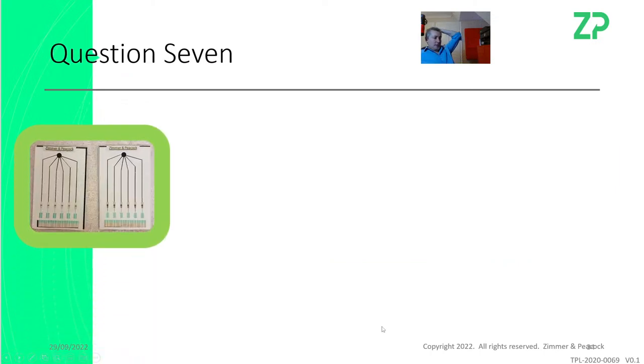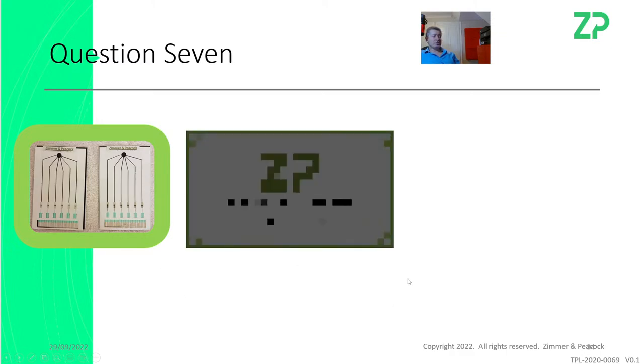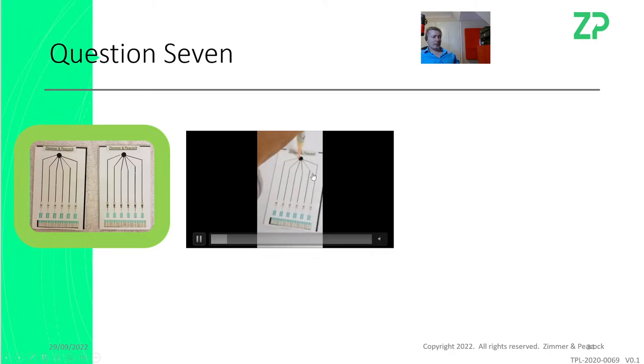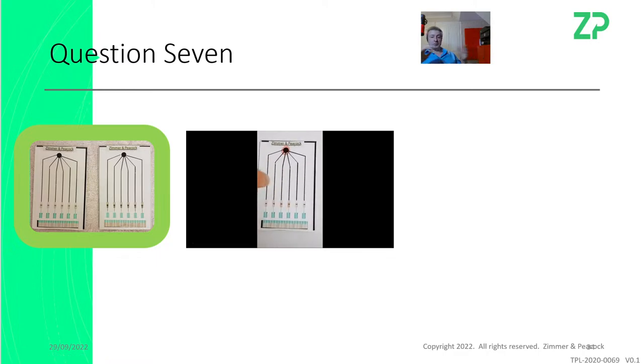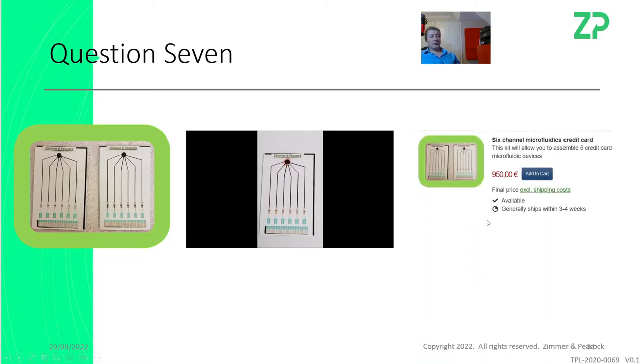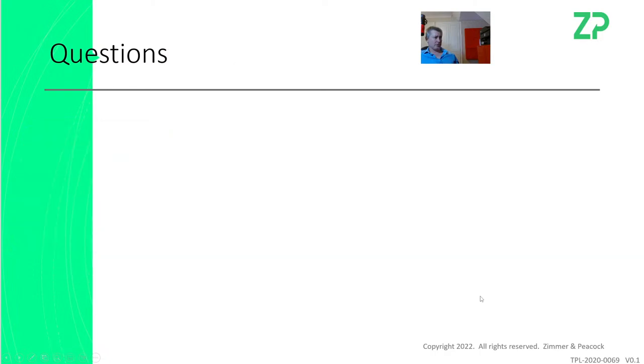Last question here: somebody wants to make a multi-analyte microfluidics device. We have a credit card format. Just for your interest, I've got the video going on here. You could put a single sample up here, and the sample will distribute down to several wells, so you can do things like sodium, potassium, chloride, pH and conductivity all on the same credit card. You have to make electrical contact with this credit card, but that's what we're playing with, and we do have a construction kit for doing that, which is also on the website and linked to here.